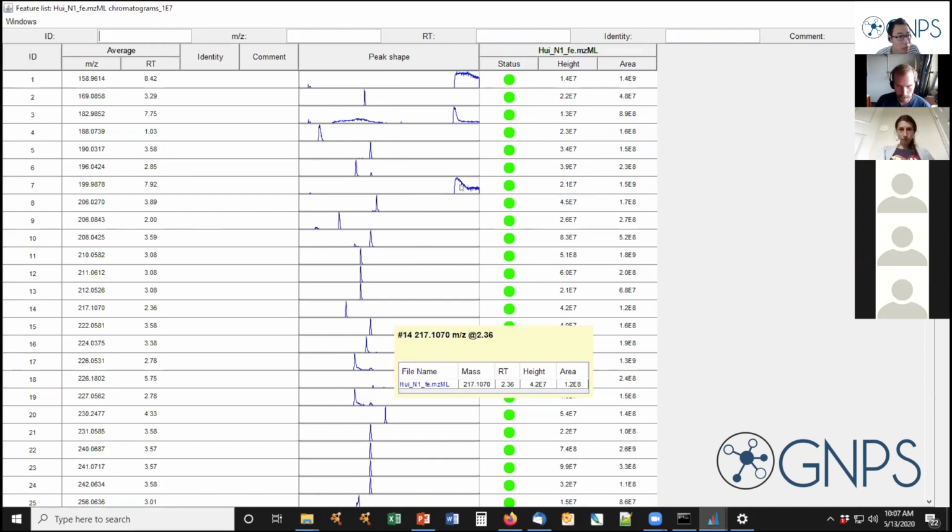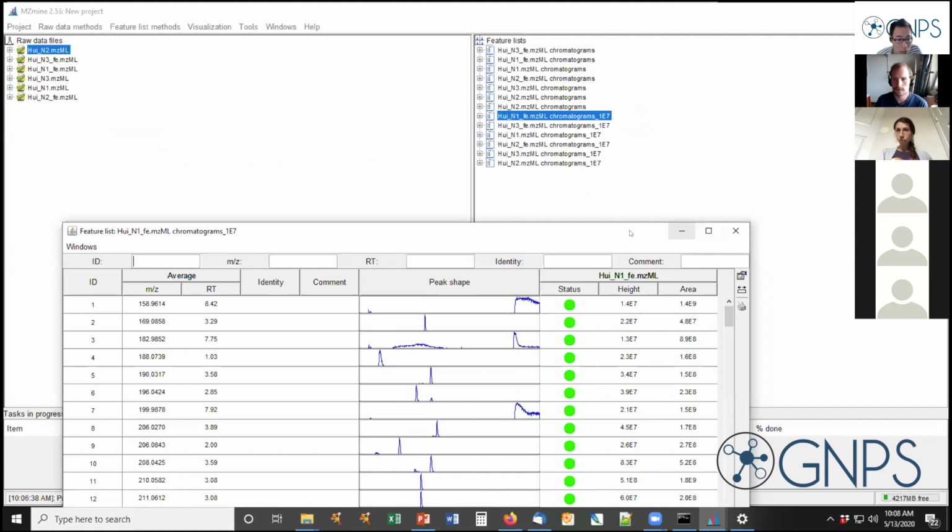and some not. So Daniel, there was a question in the previous: when you look at the files on the right, not this window, but the files on the right, when you do the processing, how can you check what parameters were chosen?